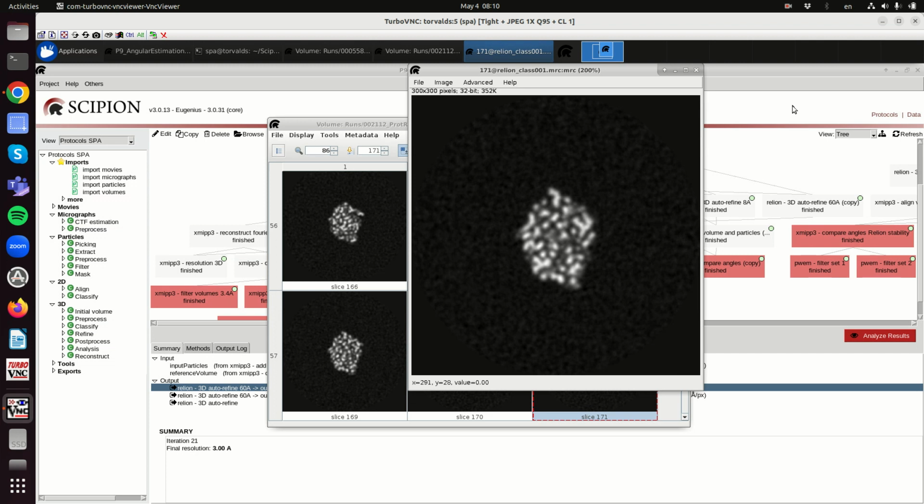So 40,000 particles should give something like this if we are capable of aligning them, not perfectly, but with decent alignment, no noise around, and perfect CTF correction. If our structures don't look like this, then we have some problems in one of these steps.